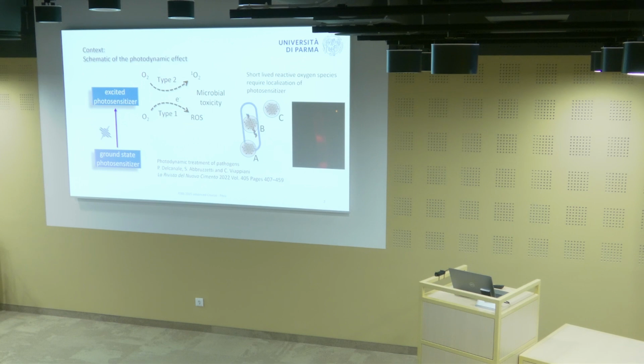So there is a lot of things you can do also with spectroscopy and, as you can see, with super resolution microscopy.